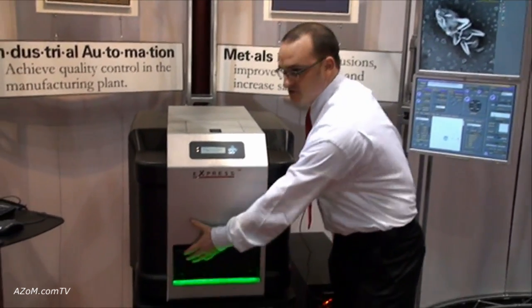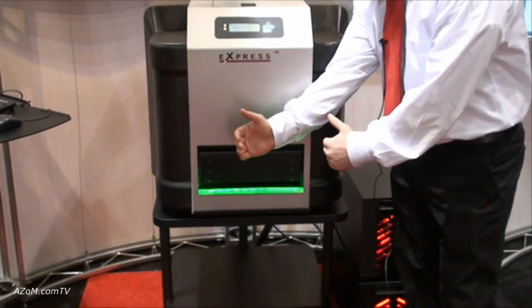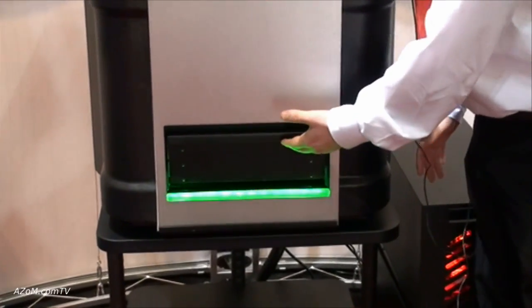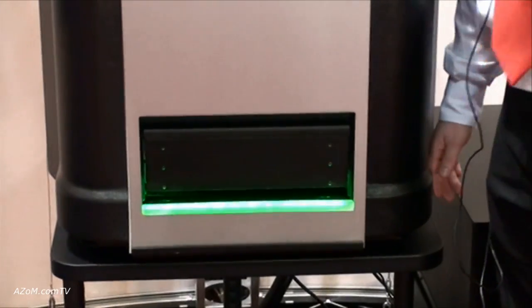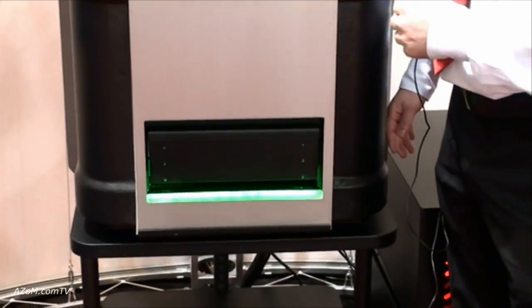The stage chamber is about three inches deep, seven inches wide by about six inches in the X direction. It has 80 by 100 millimeters of travel, which makes it very flexible and allows for large samples to be placed into the chamber for analysis.